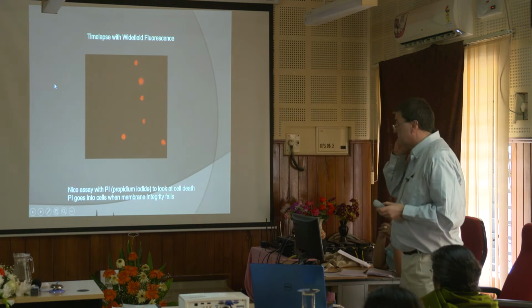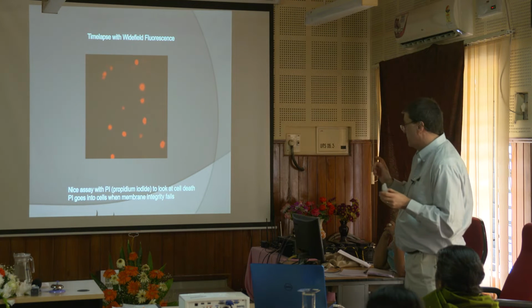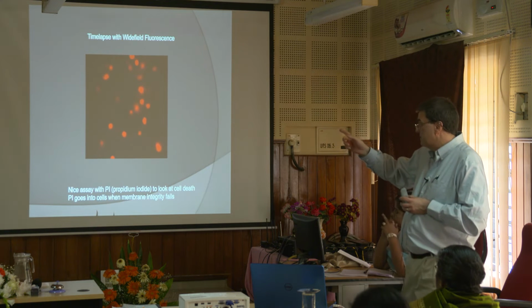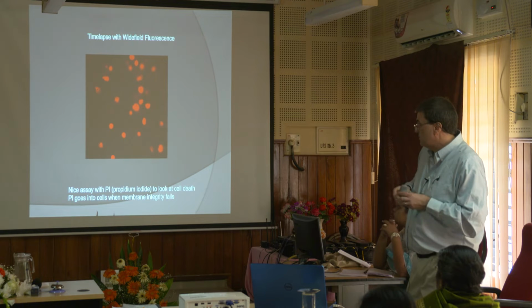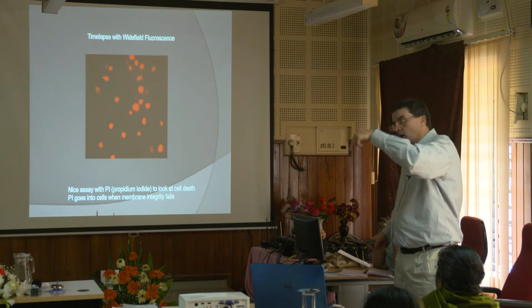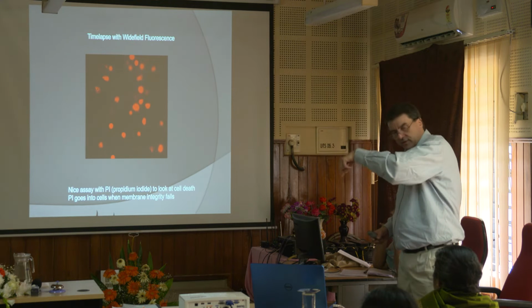So this is a time lapse. And as we added the drug or whatever, you can see the cells, this was in suspension. I think these were T cells, if I remember correctly. They would start to die as the nucleus took up the dye. Again, we did this as a time lapse. This is just one position, but we did multiple positions. We used slides that had 8 wells, and we set up different conditions in each of the 8 wells. By using the motorized stage, we were able to do 8 experiments at once, traveling between the wells and looking at the different conditions.